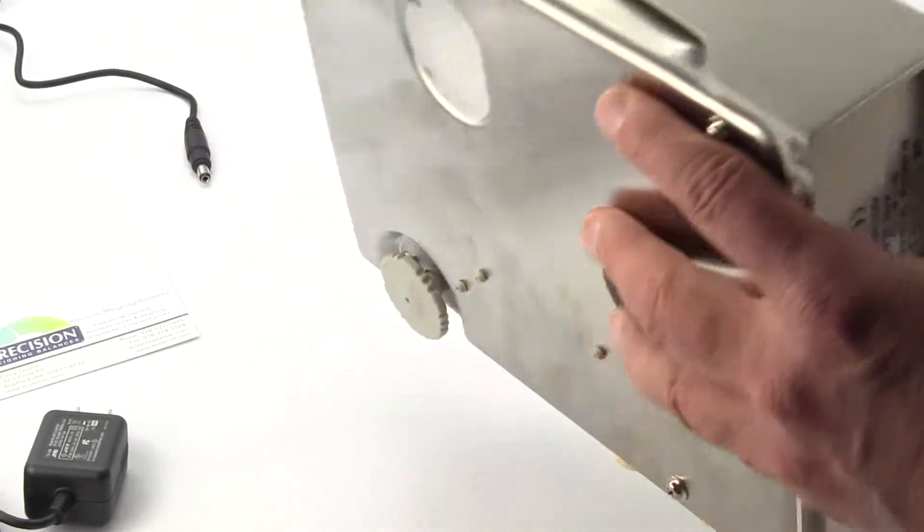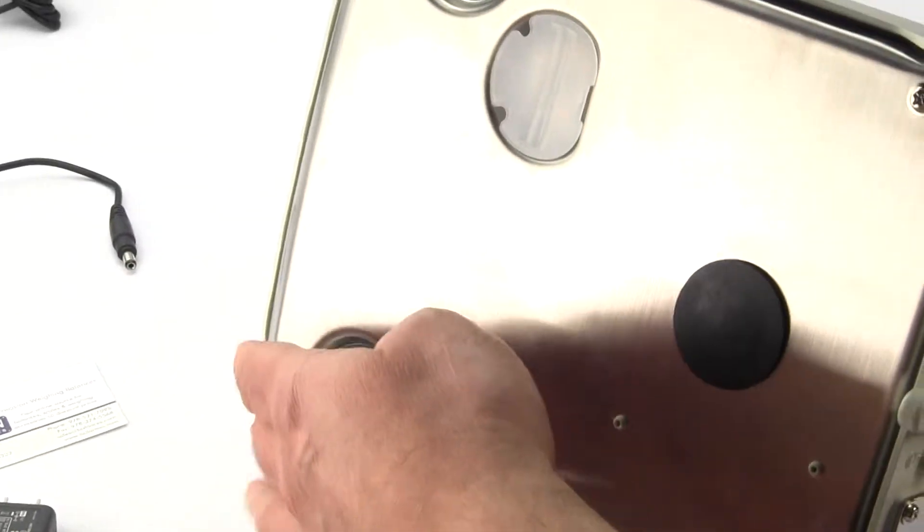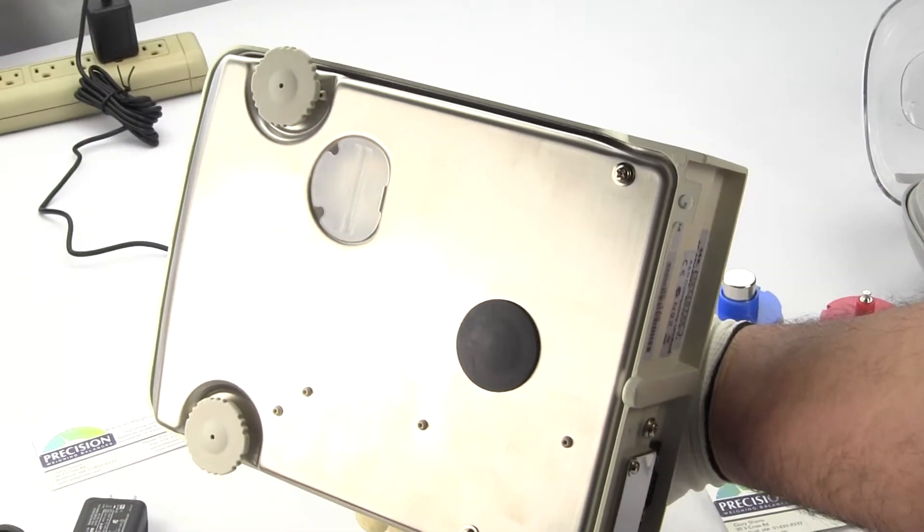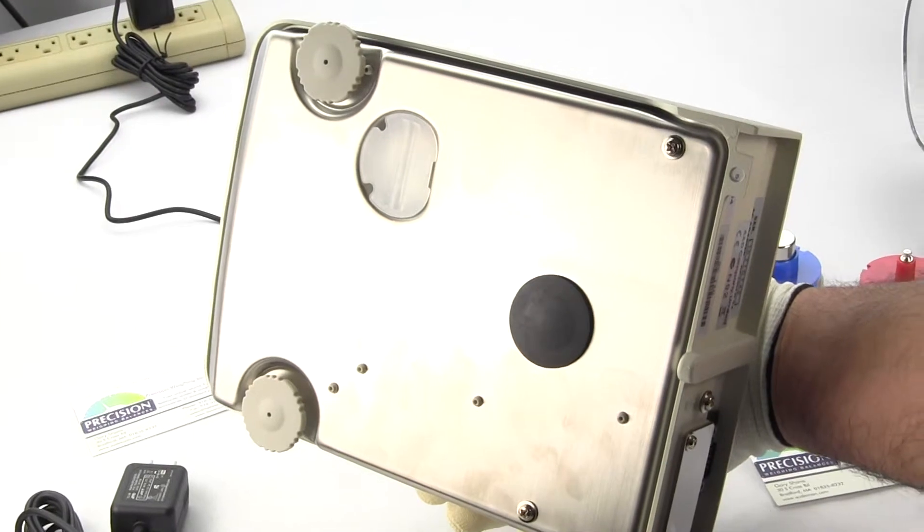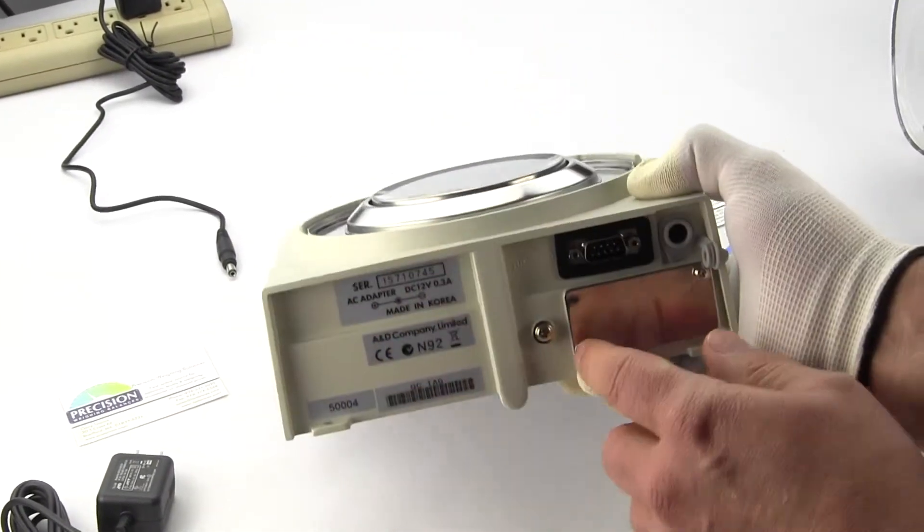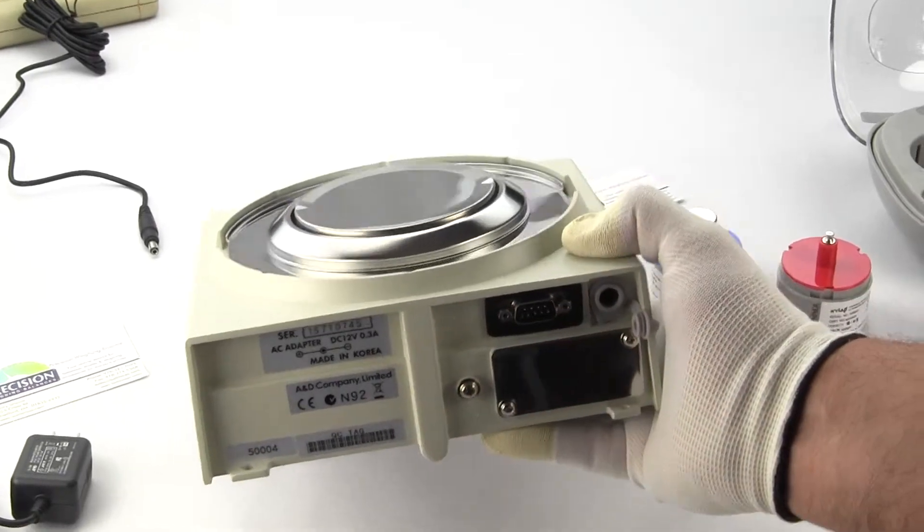On the bottom of the balance you have two adjustable feet. This here is an underhook for beneath weighing for like specific gravity. You also have on the rear of the balance we have a grounding lug for static electricity.